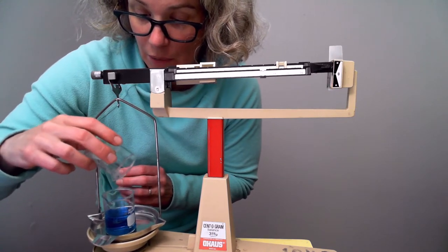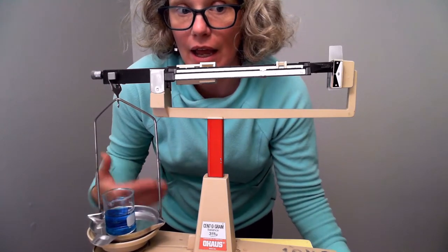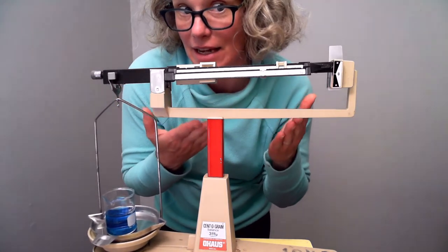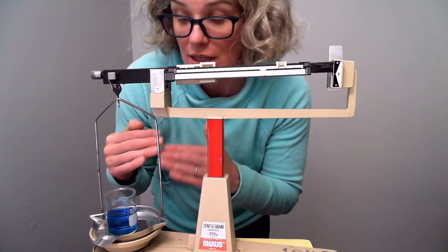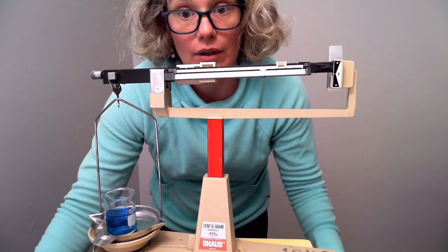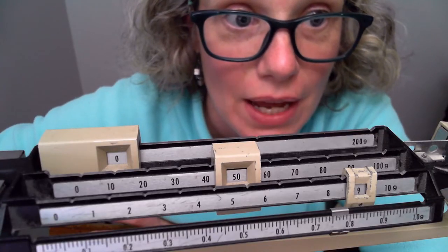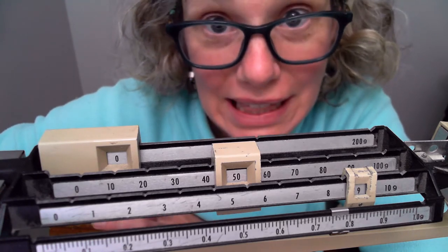Now that I have the mass of the beaker alone, I can add the liquid — or whatever I wanted to find the mass of — that I didn't want to put directly on the scale. I'll find the total mass again, and then subtract the mass of the beaker to get the mass of the water.